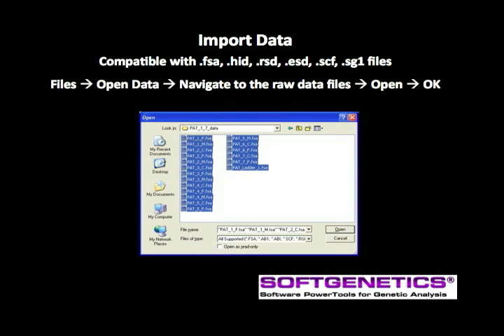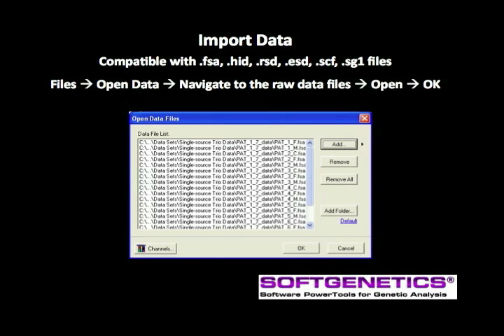GeneMarkerHID accepts files from all major capillary electrophoresis instruments, including FSA from capillary electrophoresis and 377 slab systems, HID, RSD, SCF or standard chromatograph files, and SG1 file formats. From the upper left corner, select Files and Open Data. Navigate to the raw data files and open. When all files have been selected, click OK to import them into GeneMarkerHID.